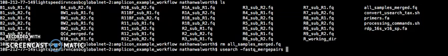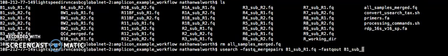And typically, you work on individual samples. So for example, you would type that in, and then you would specify a sample, like so, and then you would specify your output file, which we are just going to call b1 submerge.fq, and we can name that whatever we want.